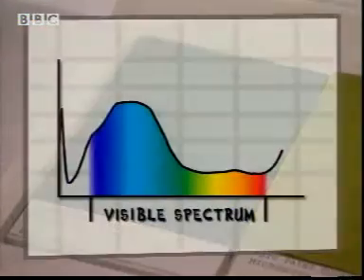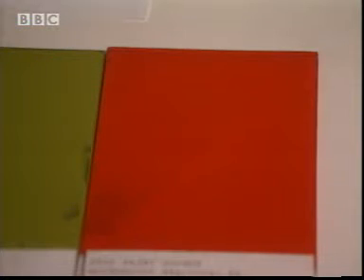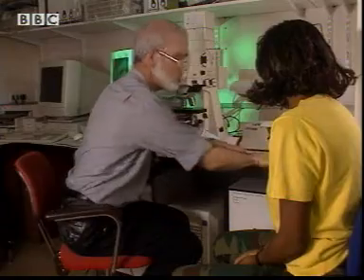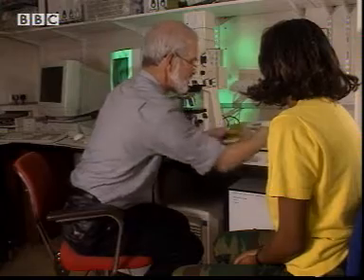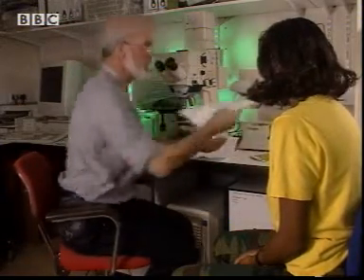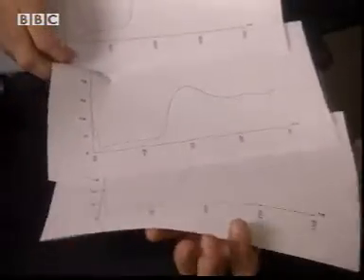A blue paint, for example, mainly reflects the blue part of the spectrum, whereas a red paint will mainly reflect the red part of the spectrum. Your problem is slightly different. You've got different reds. So let's take these 3 greens and they look almost exactly the same. Yeah? Yep. But when we look at the spectra of those, we find that actually they differ quite a lot.